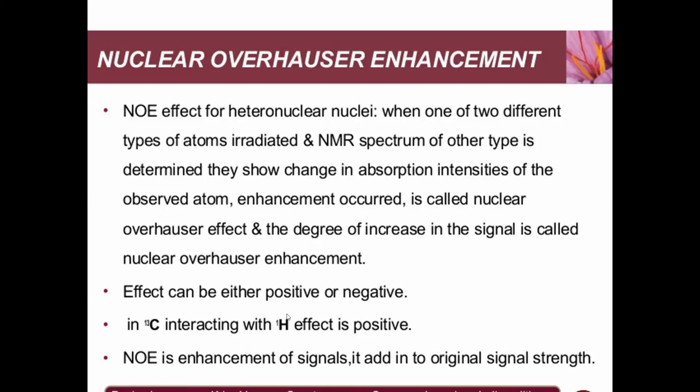This effect can be either positive or negative. In C13 interacting with a proton, the effect is positive. Here, the distance between the neighboring protons should be less than 5 angstrom units.